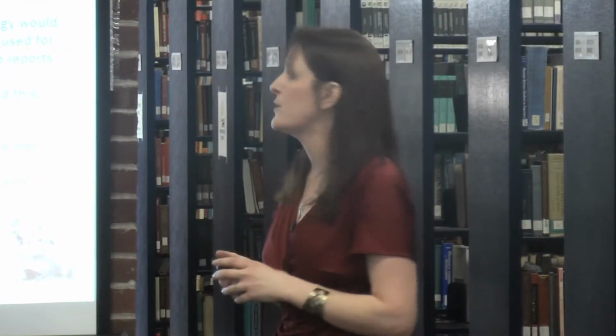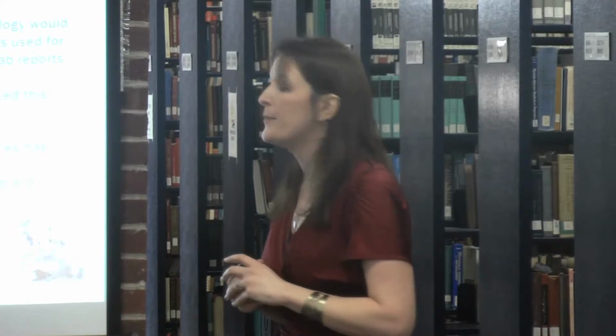an electronic piece of paper, so that I could have them play with it in a way that made it unique to them, but not go so far from what we expect from laboratory notebooks, because we really still have to teach the students the basics of record keeping in the lab. So it was important to incorporate that with the idea of this new device. And that's how I came up with the paperless lab aspect of it.